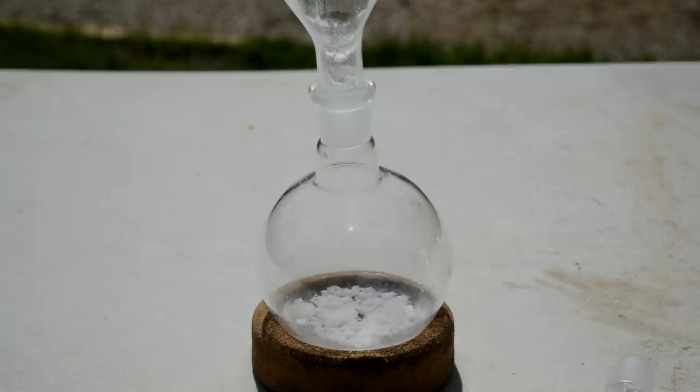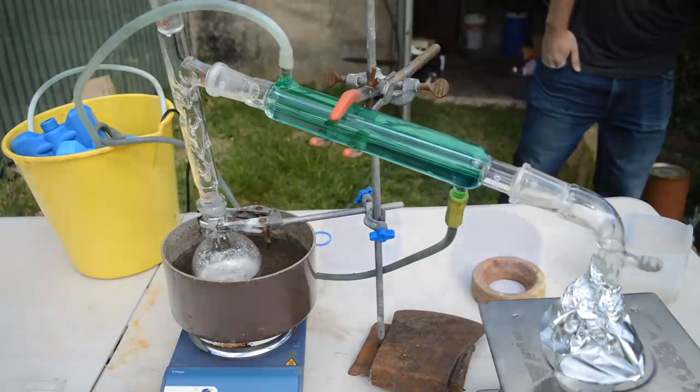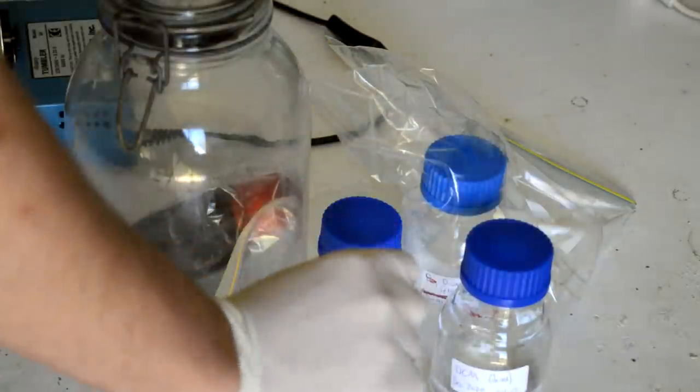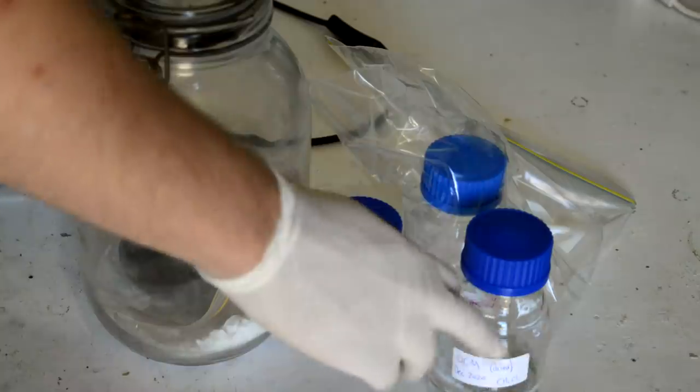And I did that because I just wanted to. Sometimes I just do chemistry because I want to. I just wanted to see how it worked and getting this stuff really dry. We need all the stuff really dry, but I did cheat a little bit on our hardware, sort of getting things from hardware stores by using phosphorus pentoxide. But we won't count it because it's not a reagent.